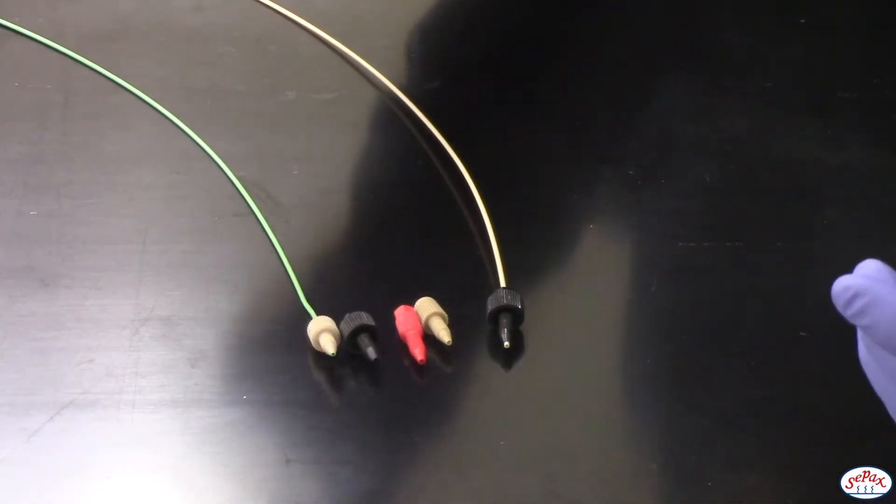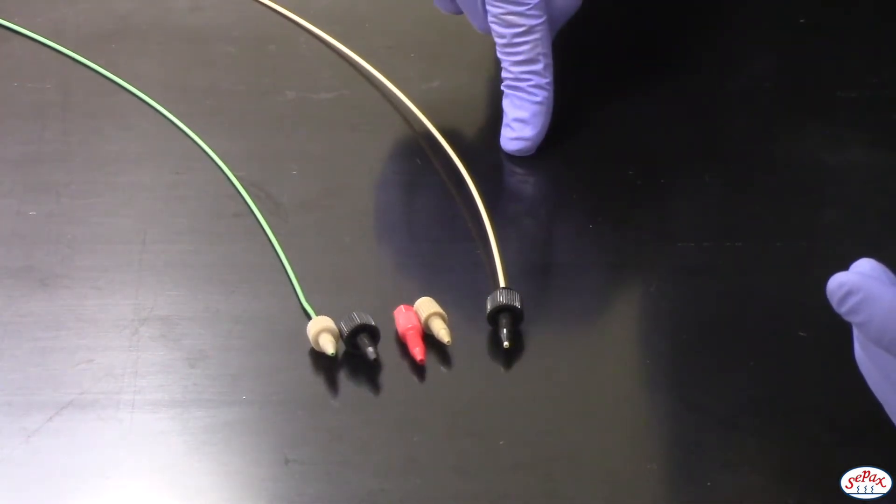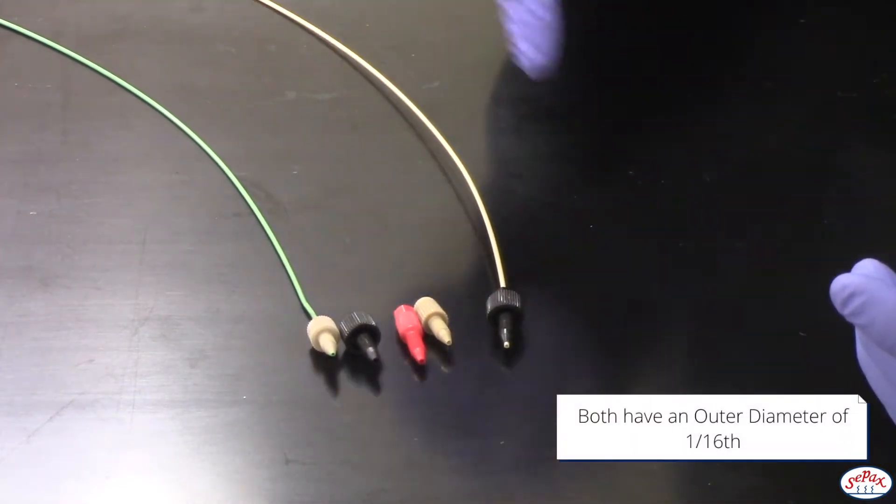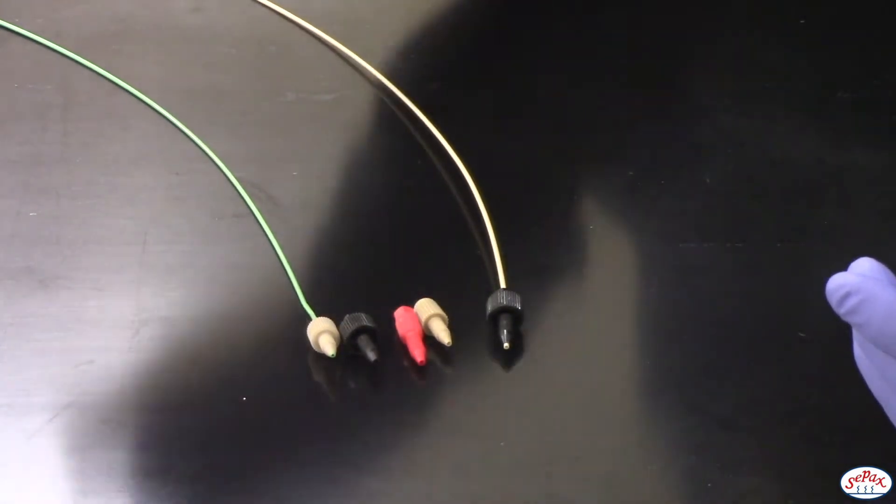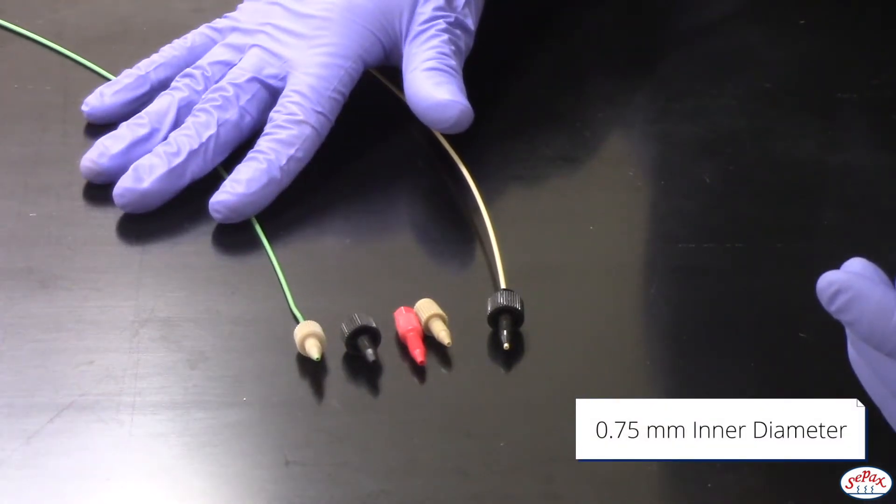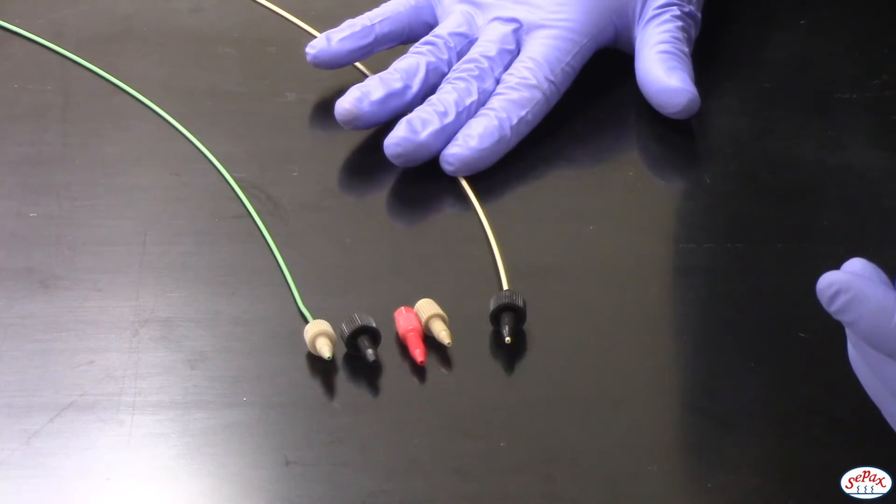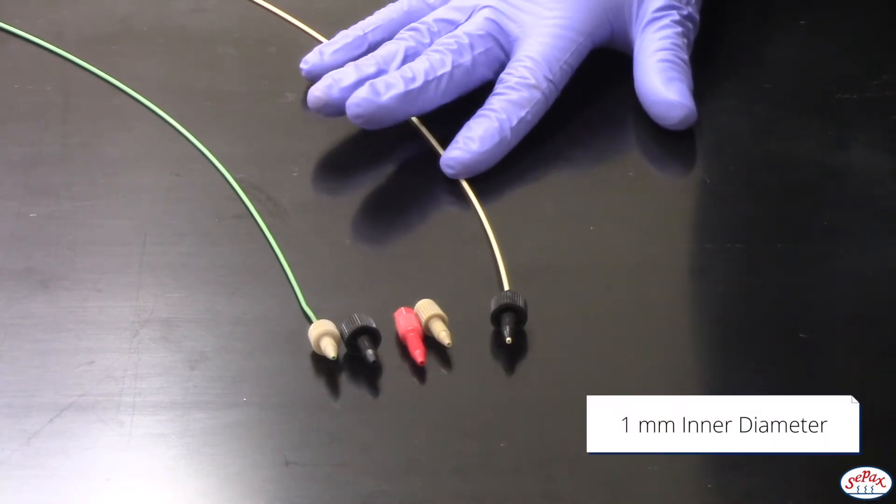So here we have two different color tubings which have different inner diameters. Both have an outer diameter of 1/16th, which allows them to fit with the 1/16th connectors here. The green tubing has an inner diameter of 0.75 millimeter, while the beige tubing has an inner diameter of 1 millimeter.